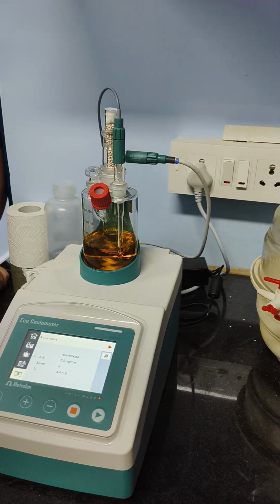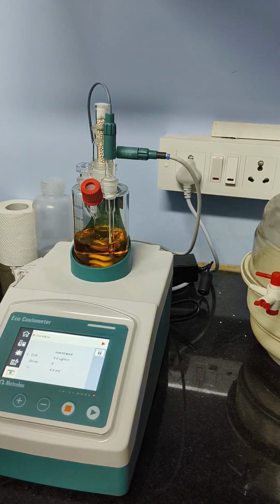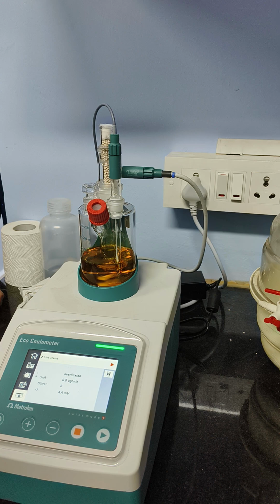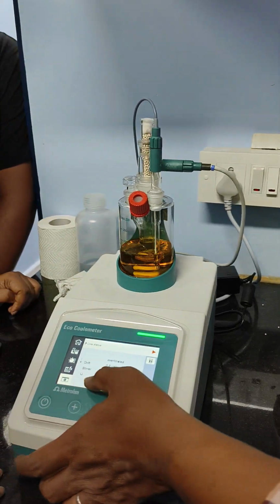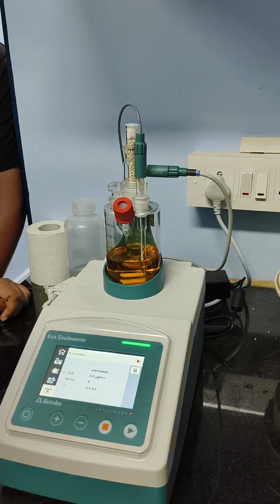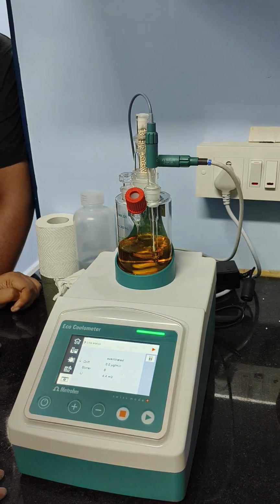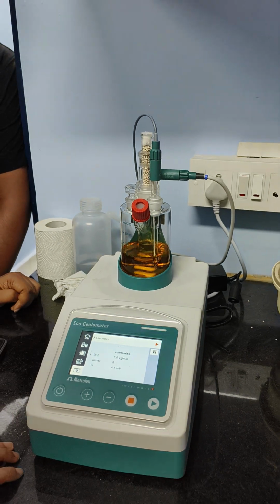Drift 0 means it's good, or no? Drift 0 is good for me, but the potential is a concern for me. It is 4.4 millivolt, and the range is 50. My expectation is 50 to 53. So it has already been used.